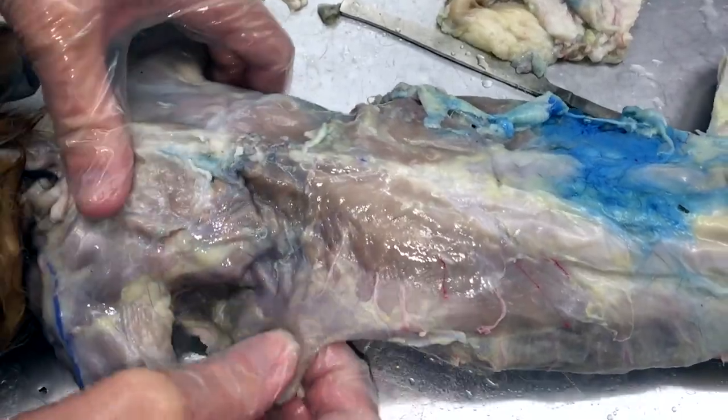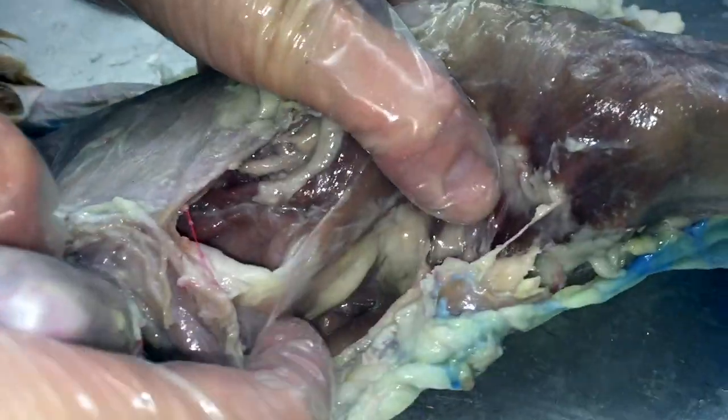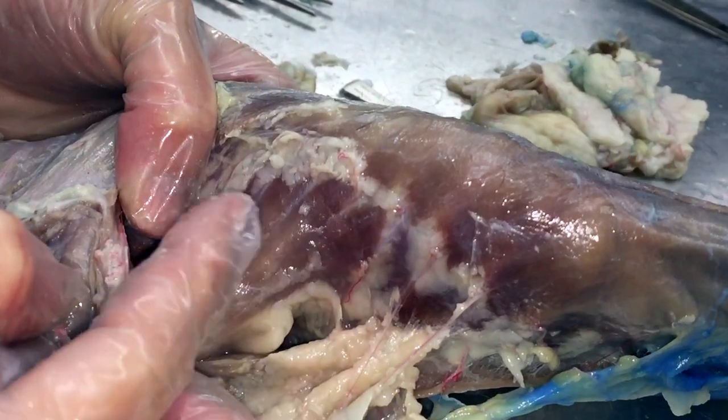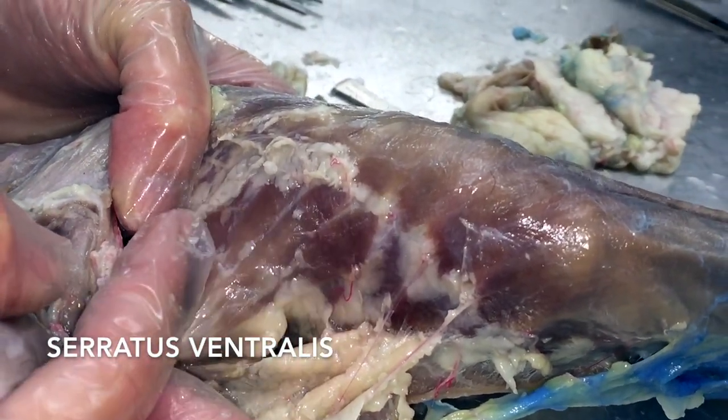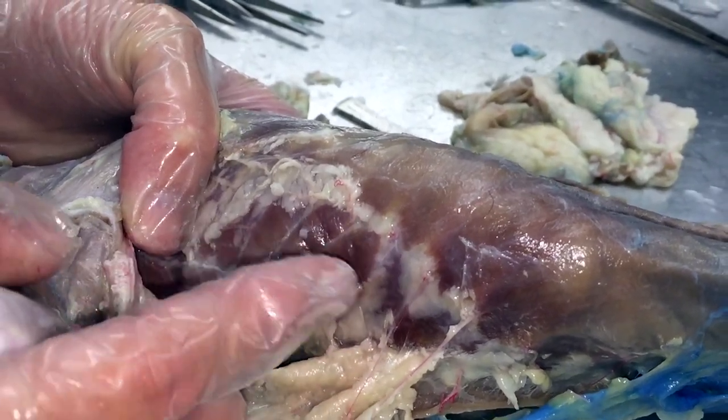The only other thing you need to be able to find is if you go into the armpit. We've basically gotten the latissimus dorsi out of the way. This chunk of muscle looks sort of like a fan — it's going to be your serratus ventralis. In people it's called the serratus anterior — basically the same exact thing. So that's the last one.